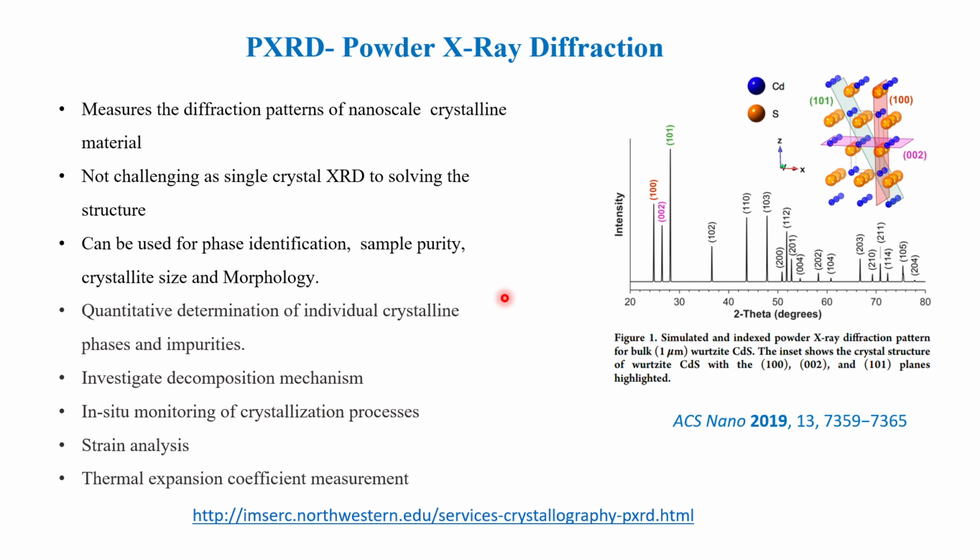It can be used in phase identification, sample purity, crystalline size, and morphology. It quantitatively determines the individual crystalline phases and the impurities as well. Nowadays we also use it in the in situ monitoring of the crystallization process, strain analysis, decomposition mechanism, and thermal expansion coefficient measurements.